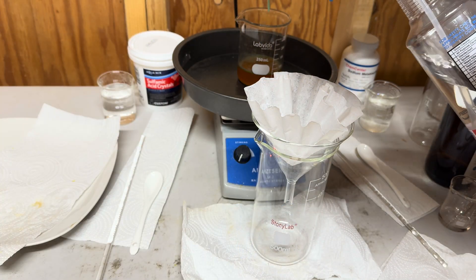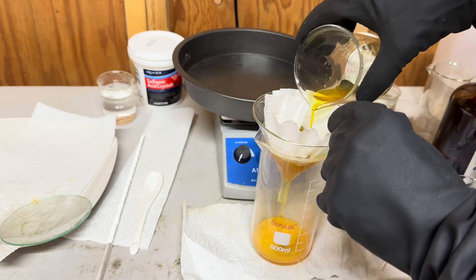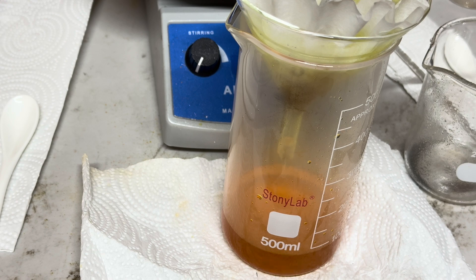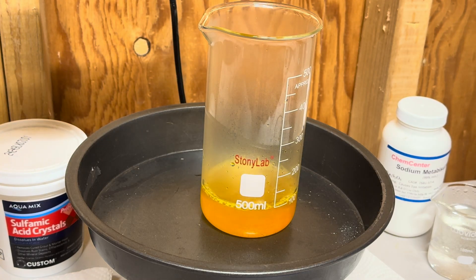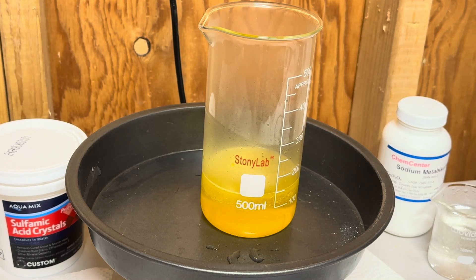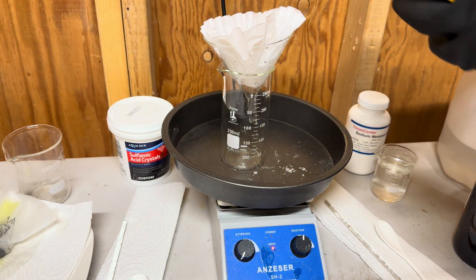Let's filter out our aqua regia. Now we will add in our sulfamic acid to neutralize — or denox — the nitric acid in our aqua regia solution. Now we will filter our aqua regia.